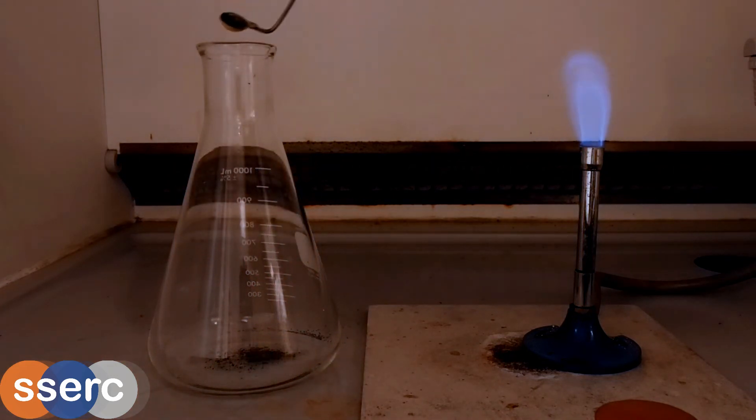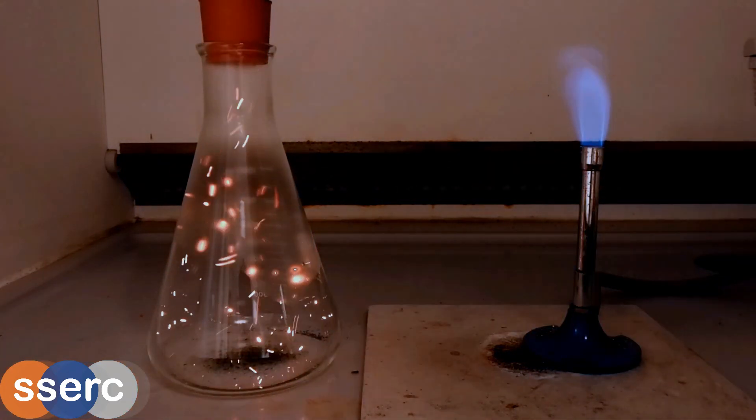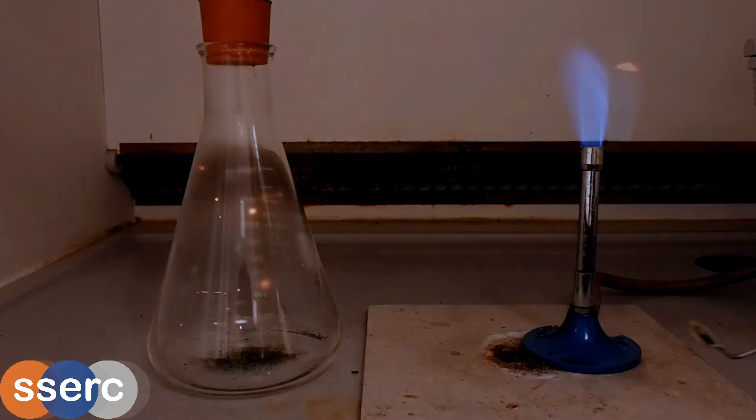Particles of chromium oxide are catalyzing the oxidation of the ammonia and this reaction is exothermic. This produces the heat which causes the particles of chromium oxide to glow brightly.